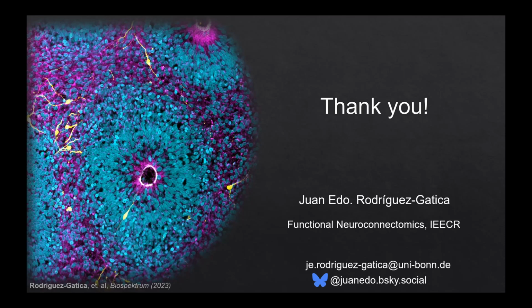In the same direction, what are your favorite fluorescent proteins for preservation of fluorescence in your experience? Sorry, what are the fluorescent proteins that work best in expansion, where the fluorescence is best preserved in your hands? Well, in our hands, we have tested a lot, for example, with this technique called TEDBO. For example, mCerulean, EYFP, tdTomato work really good, but we also have tried others like mRFP or mCherry, also working quite good, but all the neon green and so on.